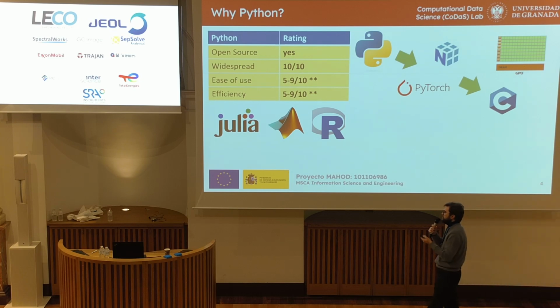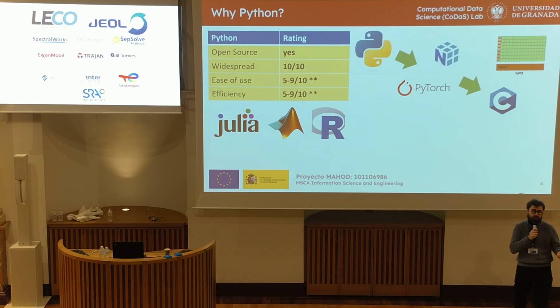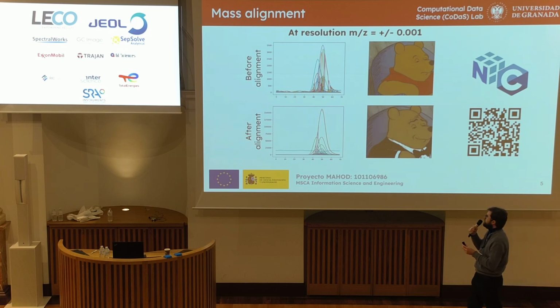Some Python haters will say that Python is slow, but in fact, you can parallelize a lot of the tasks in a lower level language, like C, since most Python functions are actually written in C. So if you're using PyTorch, it's very similar to NumPy, but it can be distributed across GPUs, which is really nice, very fast. So the first thing when we're dealing with high resolution data is that we have to actually associate the masses together to do any sort of multilinear operations.